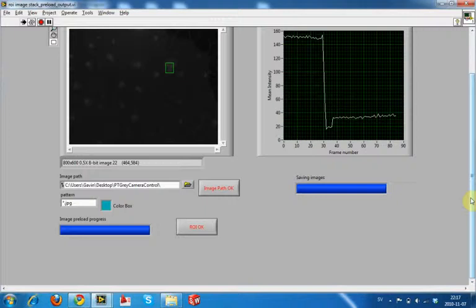And if people want to know the specifics of why we're doing that, then I will gladly explain it. But for now, we can just treat it as, instead of a typical false color that you're used to seeing in lots of programs, I mean even Photoshop will do a false color, instead of a traditional false color, we're doing what I would like to call a data maintaining false color. So we're able to give it all kinds of different colors, but we're still retaining all of the original intensity information from the original image, and that is not the case with regular false coloring.